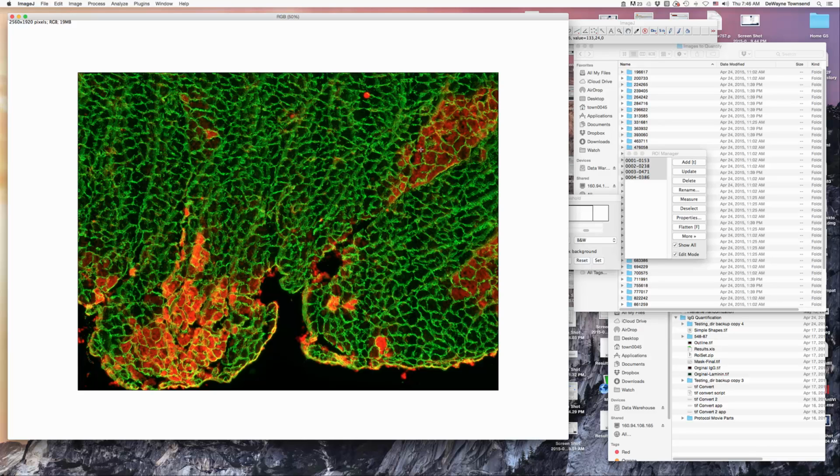This is evidence of injury within the myocyte. These myocytes have lost their membrane permeability, and endogenous IgG has been able to infiltrate inside that cell. We've also included on this particular section a co-staining with laminin. Laminin is an extracellular matrix protein. It defines the outer aspect of the cells quite nicely. So this gives you an idea of what these myocytes look like, and you can appreciate that when a myocyte is injured, it's surrounded by this IgG.